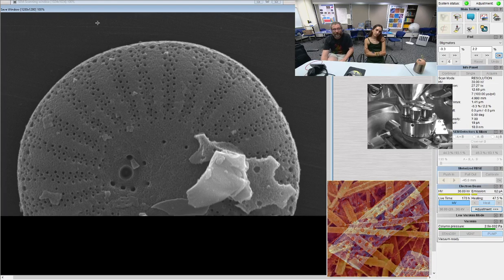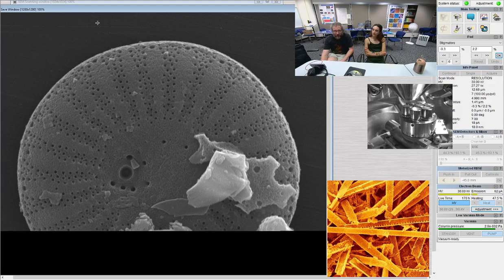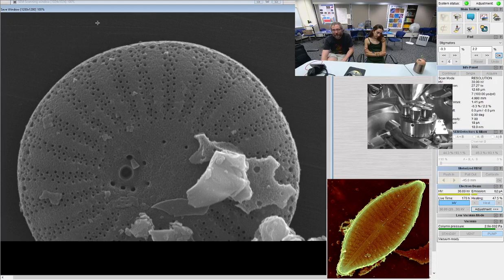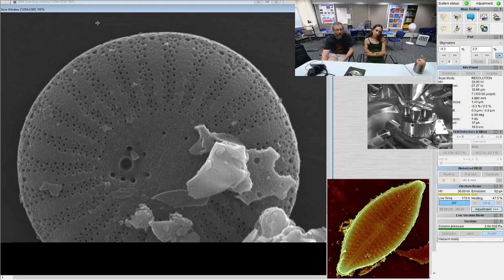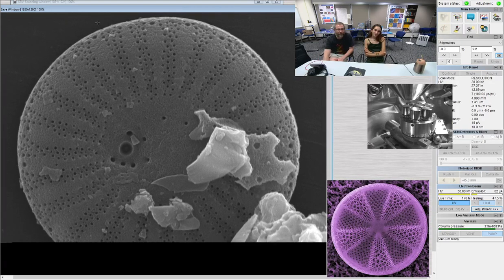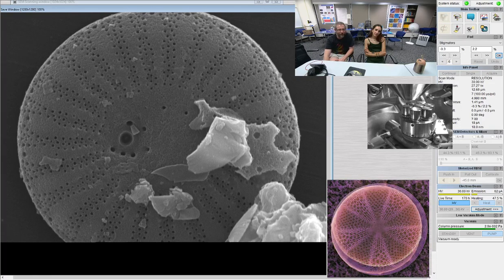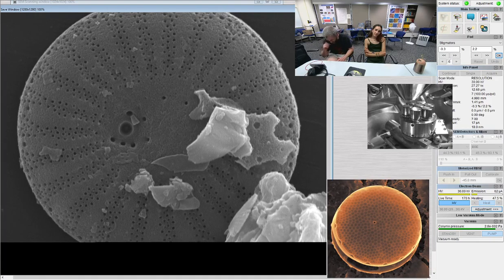If you're asking what's the maximum magnification, the microscope's magnification, we can get up to about 200,000 times before it starts to get a little blurry when it's perfectly stigmated. Right now we're only at about 27,000 times, so an order of magnitude higher than where we are if we wanted to. It would take a little bit of work to get it perfected, and we probably would need some nice clean internal views of some valves somewhere that we could work with to get the stigmation perfect, but somewhere in that range.